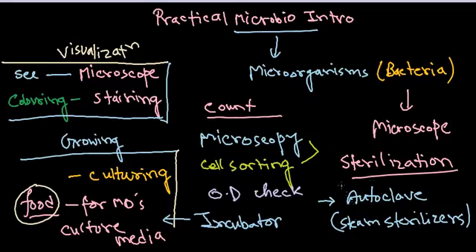And also after sterilization, what you need to do is culture. For the culturing process you require another machine where you do all those transferring tasks, because air is filled with microorganisms. If you are doing it on your simple working desk in open air, it will catch a huge amount of contamination. So sterilization won't play a vital role in that case. So you need to do this in a sterilized room or a sterilized region which is microorganism free. For that we need to use a separate type of cabinet called a laminar airflow machine, or LAF. We also say laminar airflow or LAF machine.